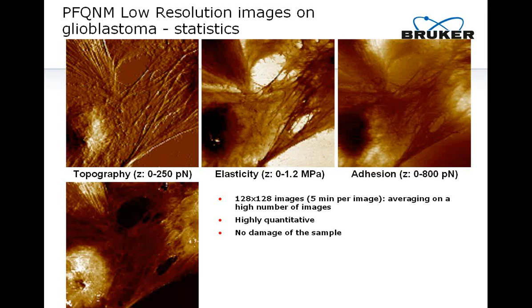Again, the height contrast in addition is not very informative for the reasons I mentioned before, but the elasticity and deformation channels provide a beautiful contrast. You can clearly see the structures under the cell membrane, the organelles, and you can clearly associate the mechanical behavior to some cell parts, like the nucleus or the lamellipodia.